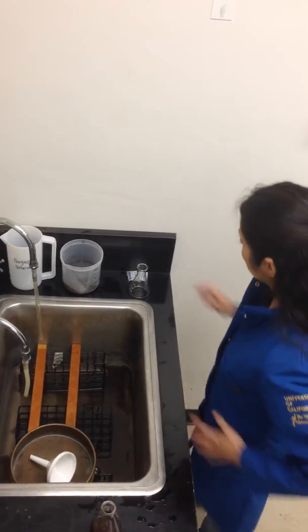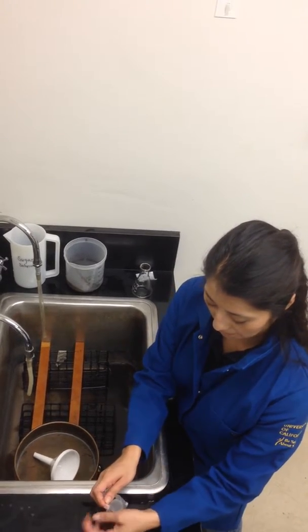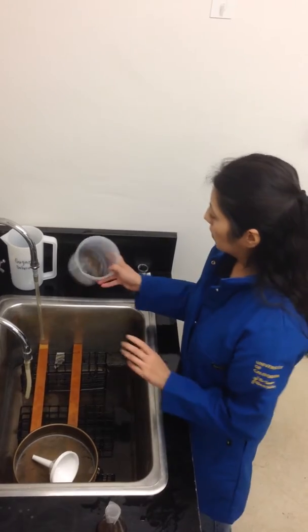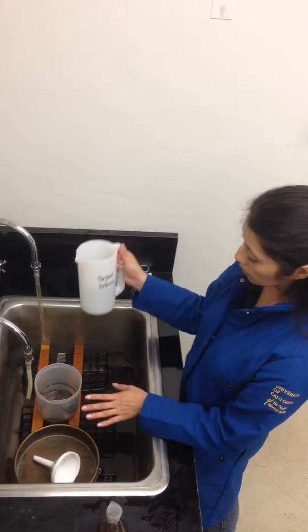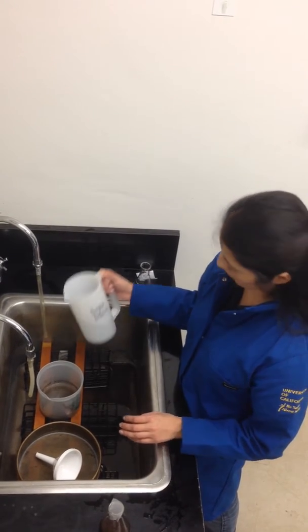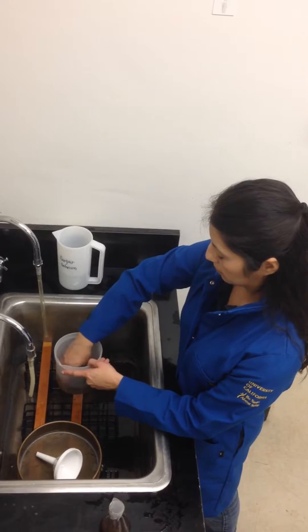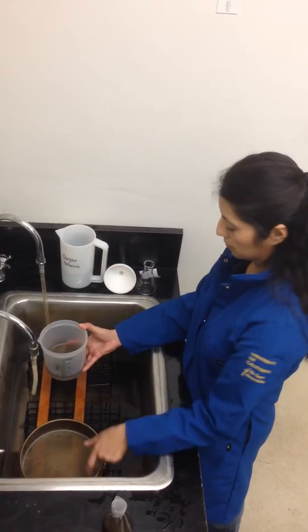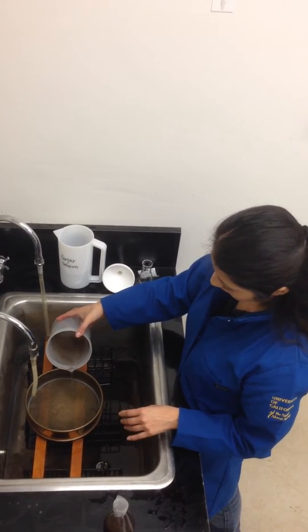Now we're going to cover it. To the sediments that remain at the bottom of our container we're going to add about three hundred ml of sugar solution. We're going to stir it again, and after we let it settle for about twenty seconds we're going to pour it back into the fine sieve.